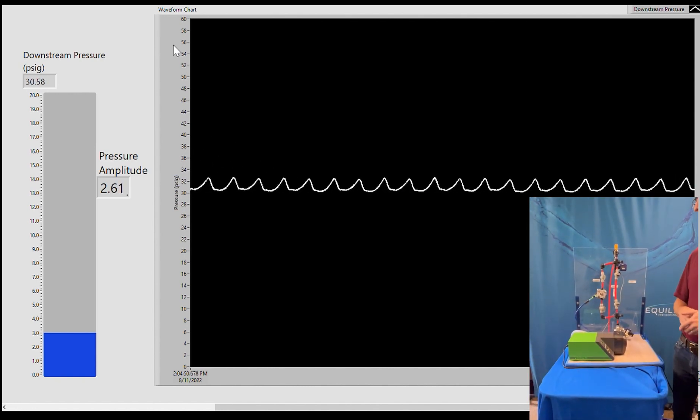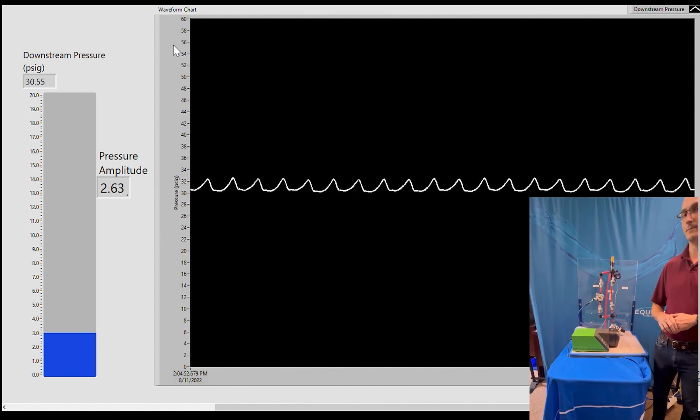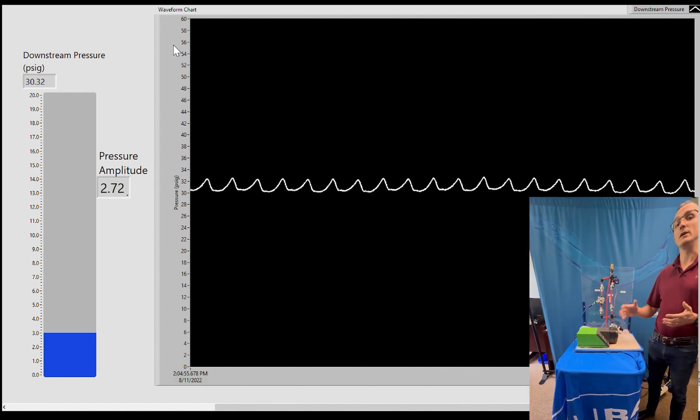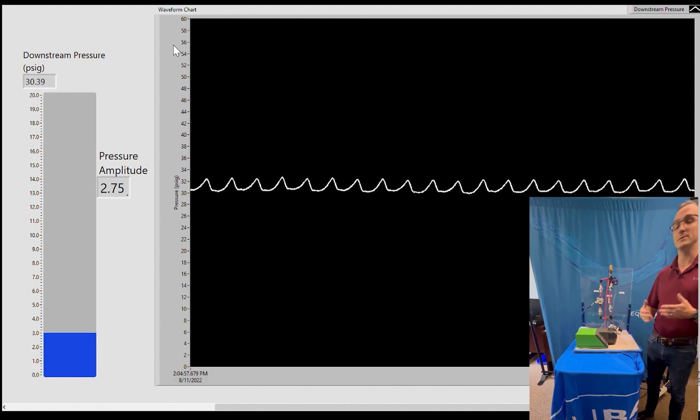We see the full dampening capability of the Equilibar single-use dampener. This amplitude was reduced from about 20 to 2 psi amplitude, which is about a 10x reduction.